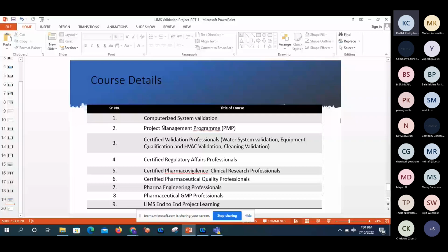So what is the content? I will explain how to create crystal reports by using the managed tables from the system. And how to tag a query to each table, they're asking. Are you going to...? No. Without the software, I can't explain that thing. Sorry for that.